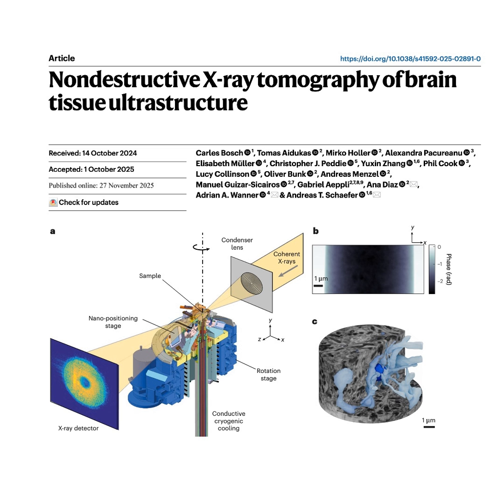That just sounds like a scientific nightmare. I mean, how do you even handle that kind of disassembly? Well, they use techniques like serial block-face SEM or focused ion beam scanning EM, FIB-SEM for short. These methods either involve cutting the sample into thousands of sequential ultra-thin slices or using an ion beam to literally mill away one layer of tissue at a time while you image the surface.